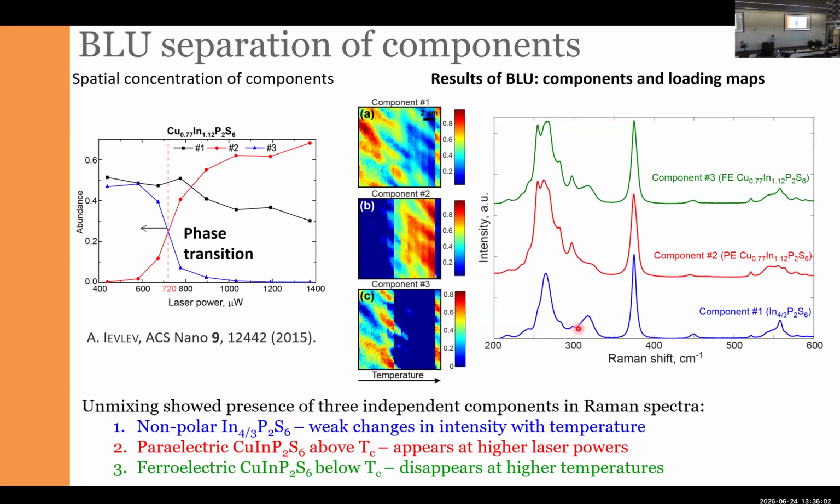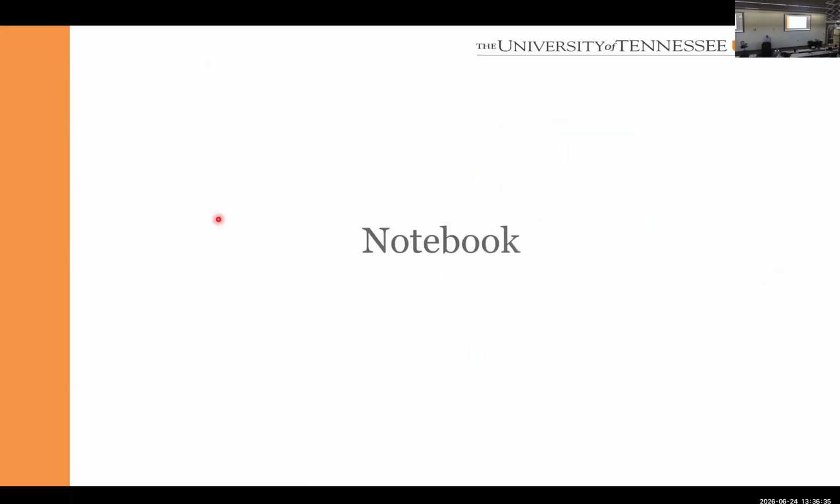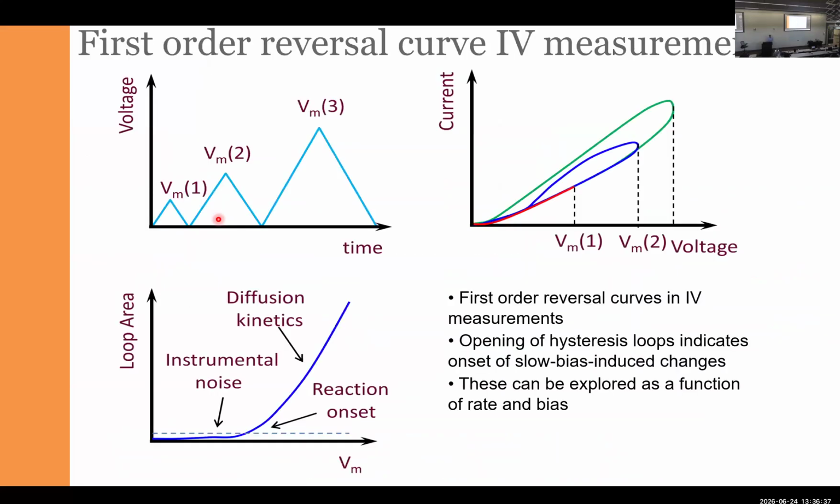Notice that in this case our data has very poor quality. It doesn't have spatial resolution. It only has variability from point to point. And we use the right machine learning method that respects the physics of the system. As a result, we were able to do blind deconvolution that tells us both the ideal physical behavior and the phase transition. Again, this type of approach can work for any spectroscopic signals as long as they're linear.